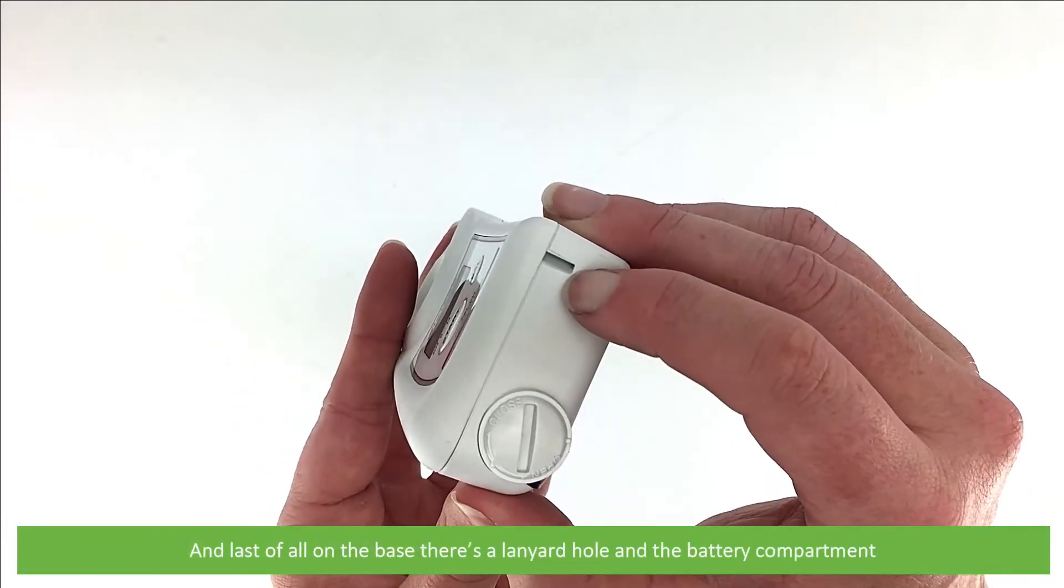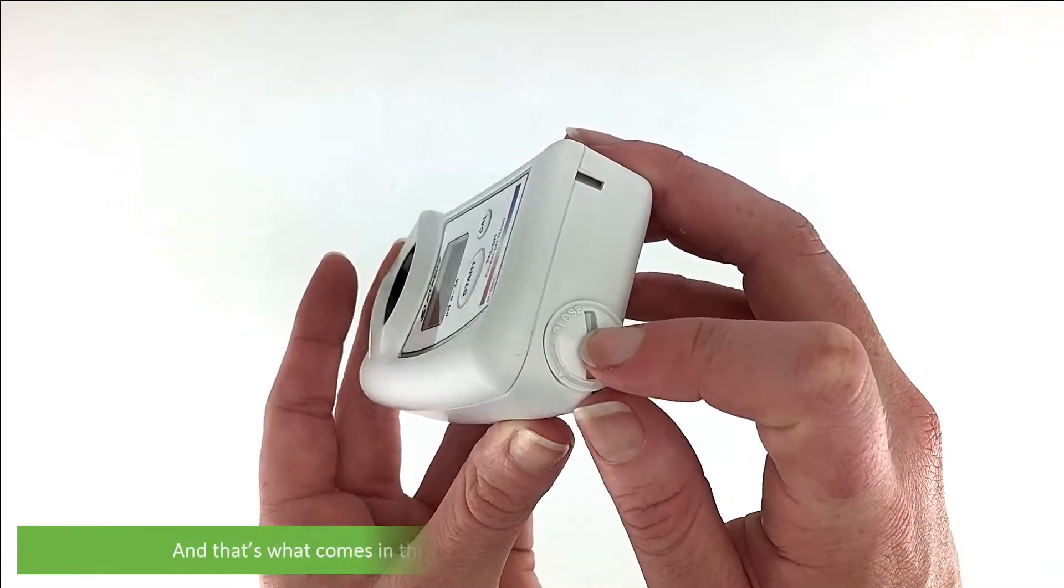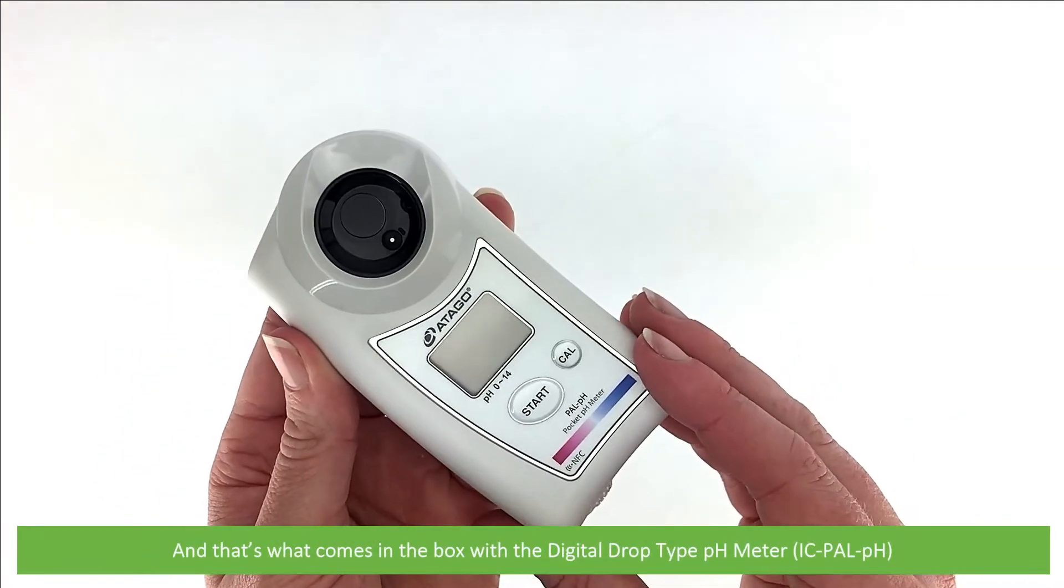And last of all on the base there's a lanyard hole and the battery compartment. And that's what comes in the box with the digital drop type pH meter, the IC PAL PH.